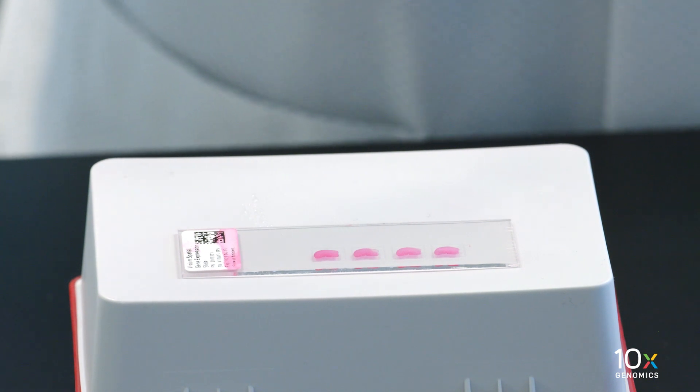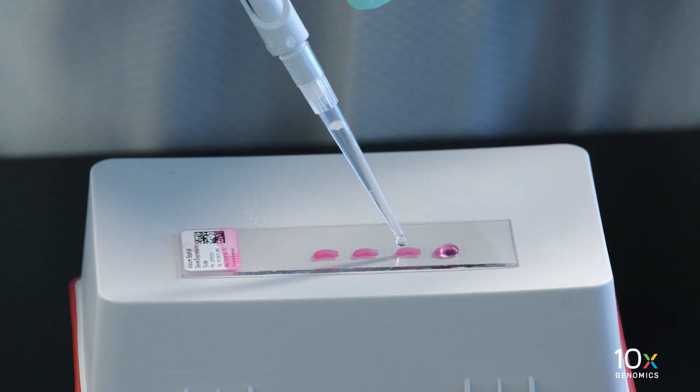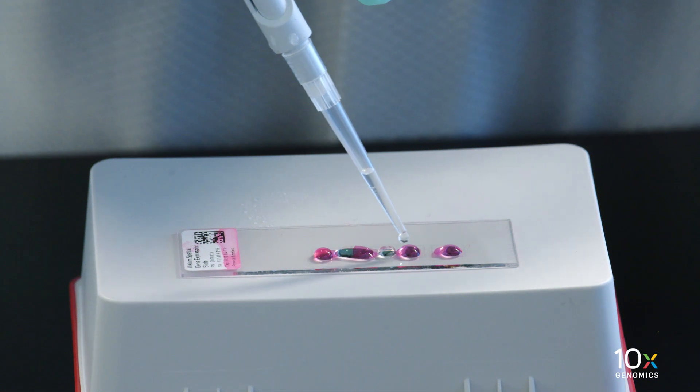Some residual droplets may remain. Using a wide-bore pipette tip, add 150 to 200 microliters of 85 percent glycerol to uniformly cover all tissue sections on the slide.